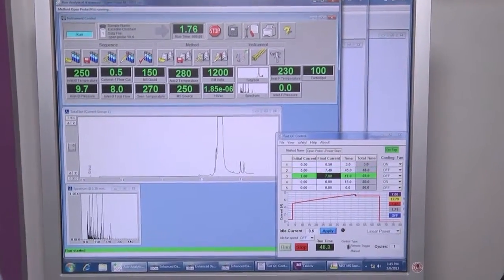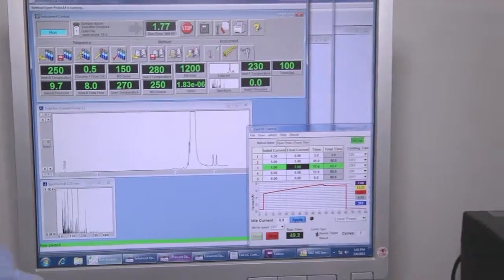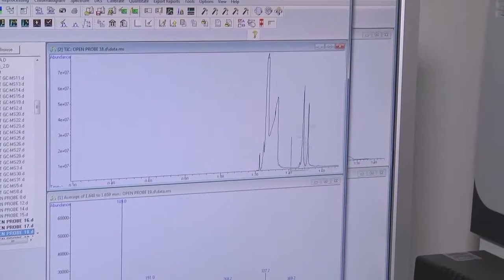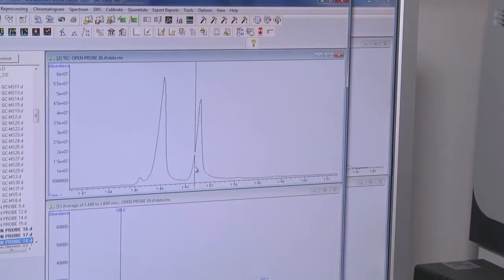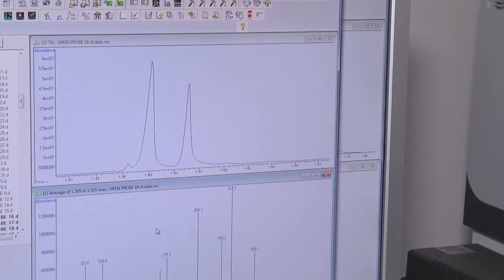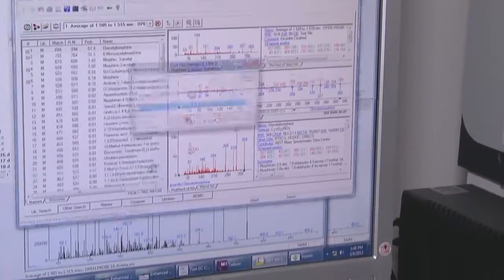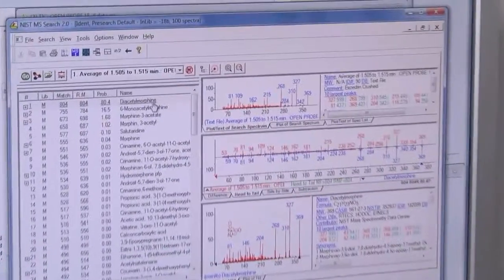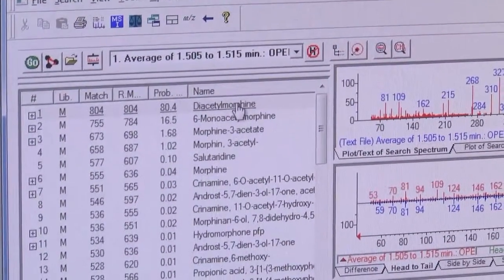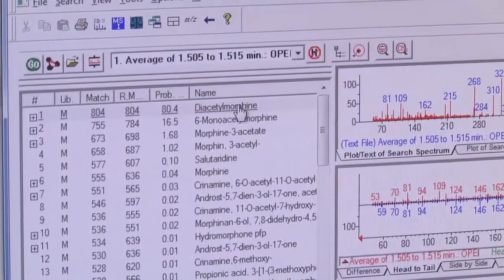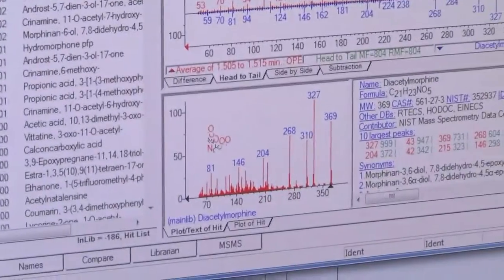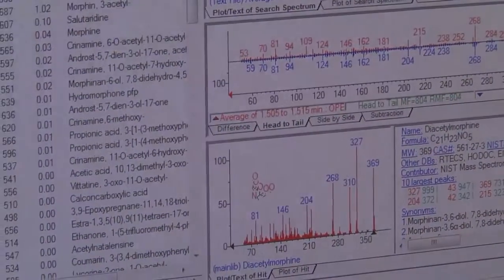Already now we can switch to the ChemStation data analysis, and here it is. We can average on the heroin peak, double right-click in order to get the NIST library search, and indeed we got diacetylmorphine, which is heroin, with 80.4% identification probability.